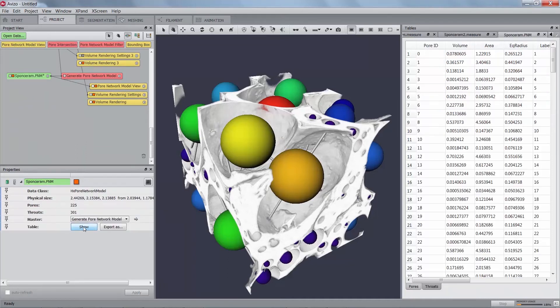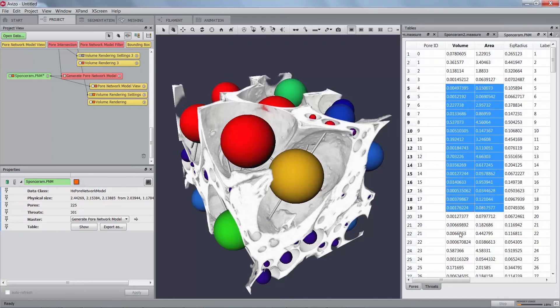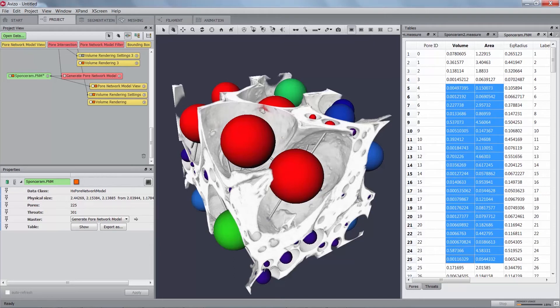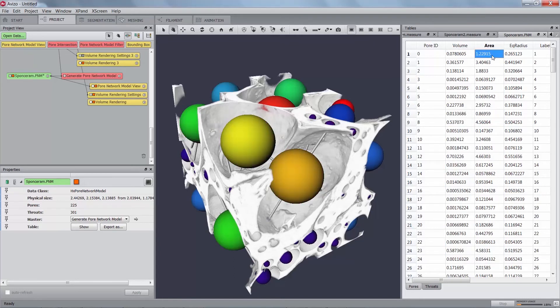The pore network model spreadsheet has two tabs, one for pores and one for throats. When displaying the pore network model with a pore network model view and displaying the spreadsheet at the same time in the table view, it is possible to highlight the pores or the throats that are selected in the table from the pores table or the throats table. Select pores in the table by left clicking on one or several lines. The corresponding pores will be highlighted in red in the 3D view.